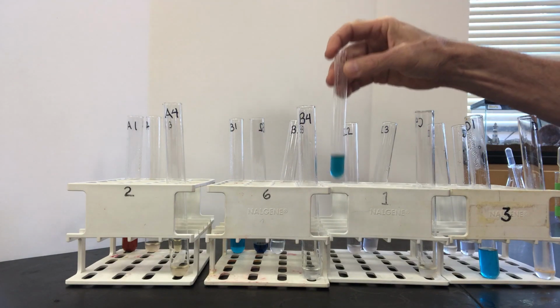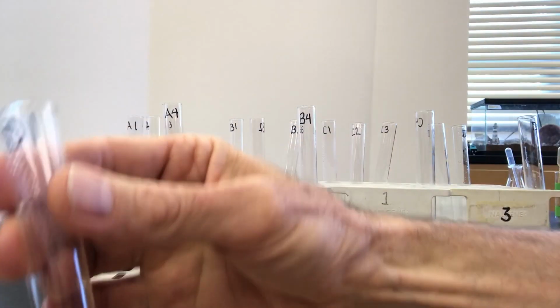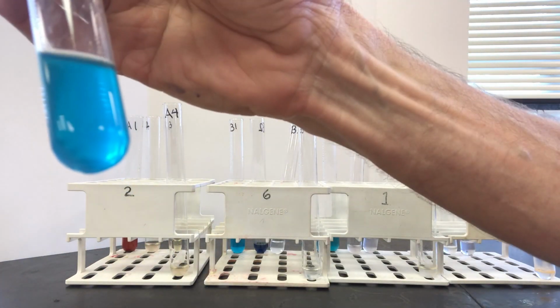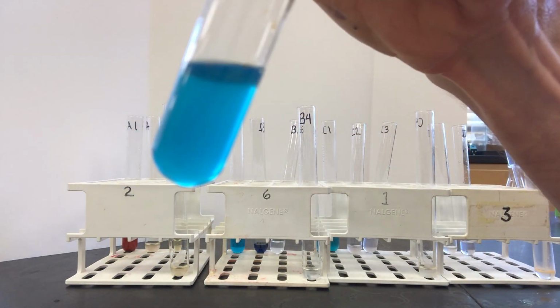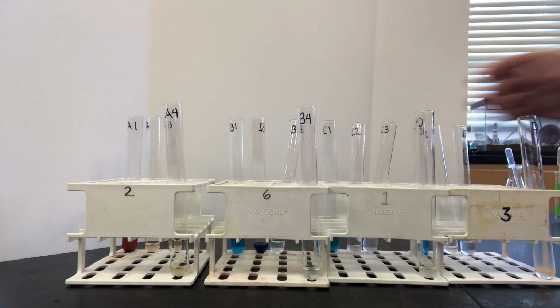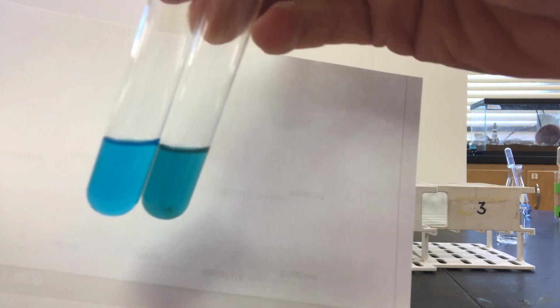And D1, pepperoni, looks like this. Remember, you're looking for both a color change, which can be orange-red to brown-green, and for the presence of any precipitate. Pay close attention to the difference between B1 potato chips and C1 refried beans for both a color difference and presence of any precipitate.